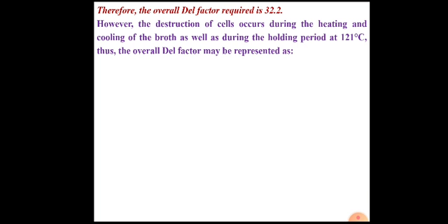This means that the destruction of microorganisms occurs during the heating as well as the cooling period. Therefore, we need to consider the contribution made by the heating period and cooling period, not only the holding period.